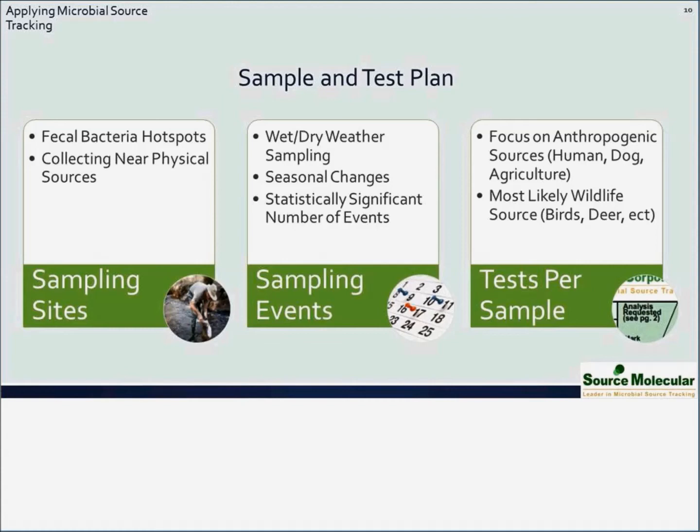That New Mexico project, I believe it was, a few hundred samples. I think it was about 200 or 300 samples. In that case, it was a complex water system. They had many different locations across miles of property, of land. And they had many different sources. They had conditional factors. In that case, they needed to do a few hundred samples. So it's really dependent on the goal you're trying to achieve.